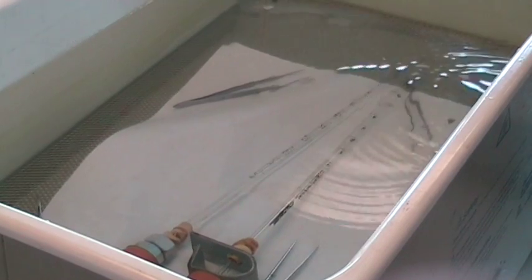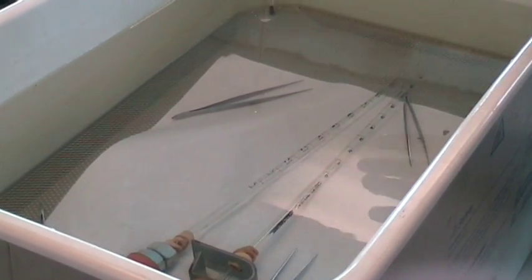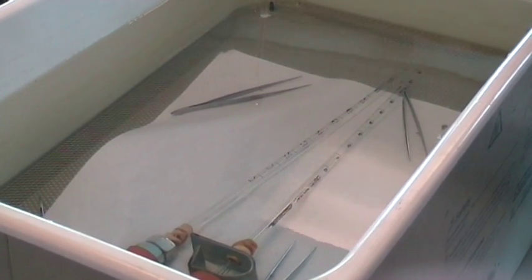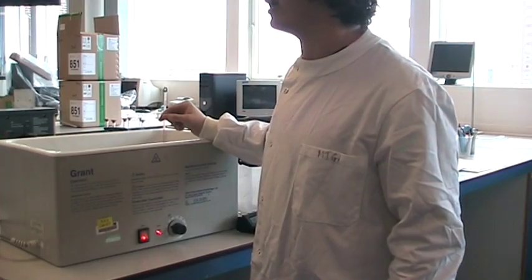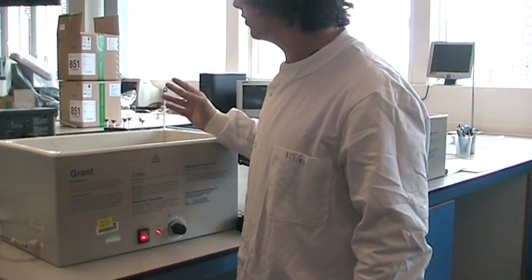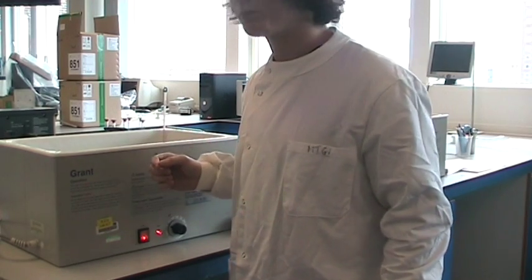and take readings from the meniscus every minute along with readings from the locust. The difference will have to be added to or subtracted from the difference for the locust, depending on whether there's been a net expansion or contraction of gas within the thermobarometer.